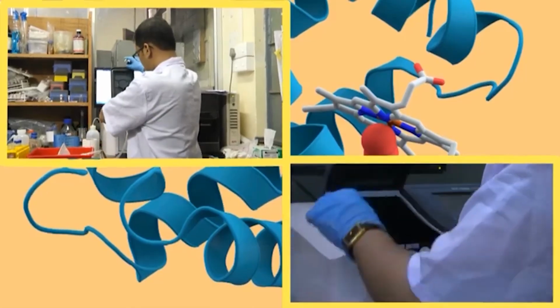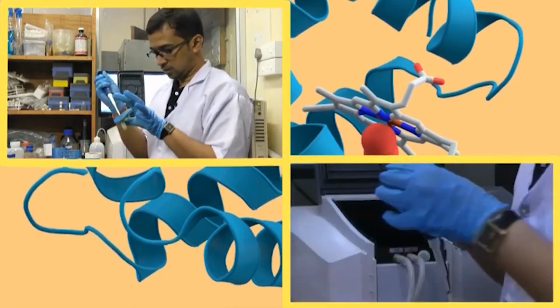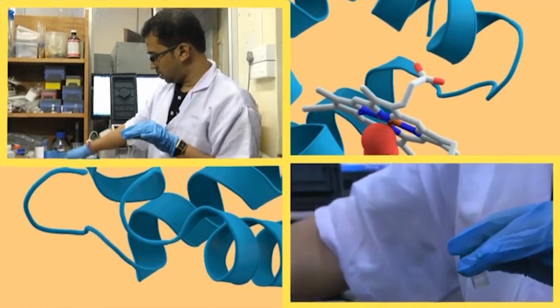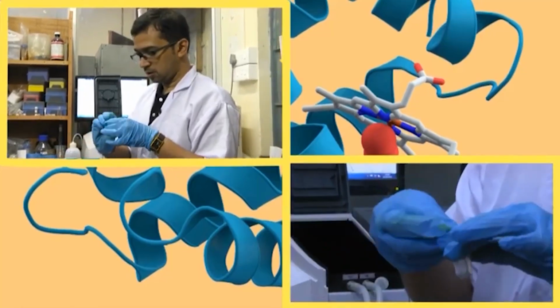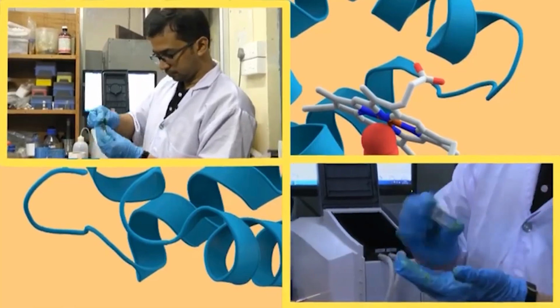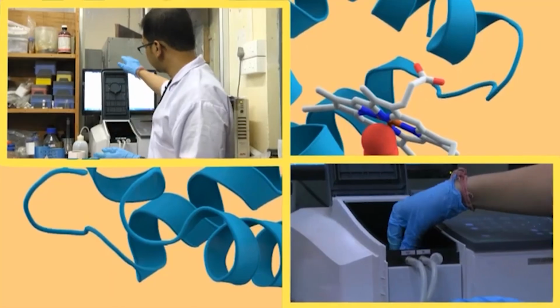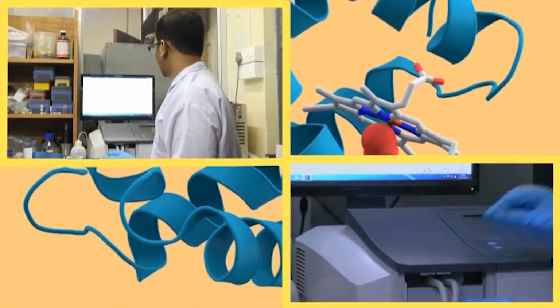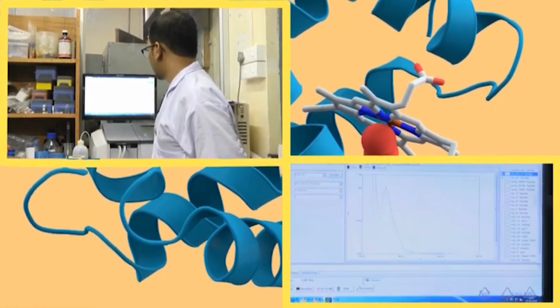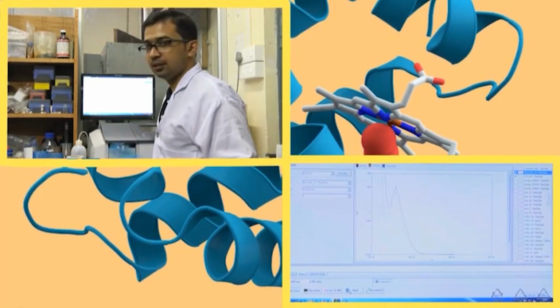Now, I will be adding again 10 microliter to it, taking this cap, mixing it thoroughly, okay. And after mixing, doing auto zero. Please make sure that the solution does not spill out when we are mixing it.